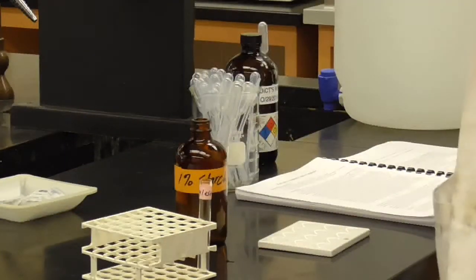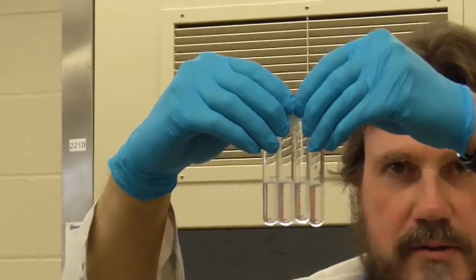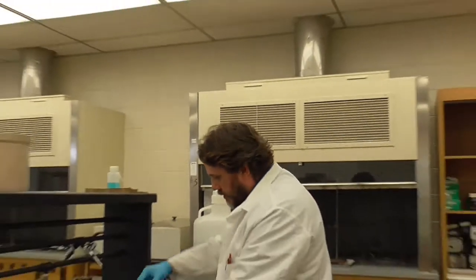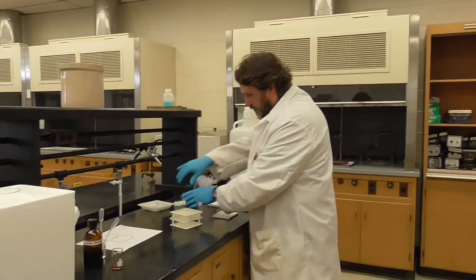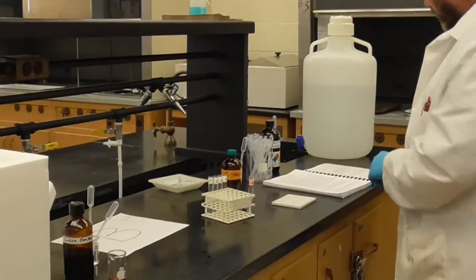So let me see. There's my 4. Hey, I did pretty good actually. They're all just about the same, 3 milliliters in each one. And so I'm pretty happy with that. We're going to leave it just like so. Okay, so my substrate, that is to say the reactant of the reaction, there it is, the same in every single test tube.